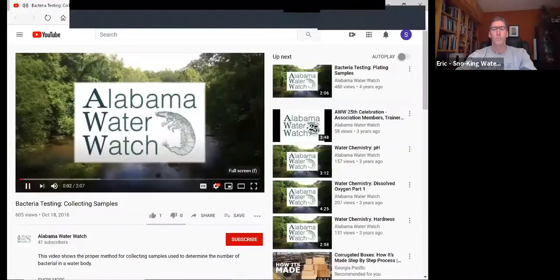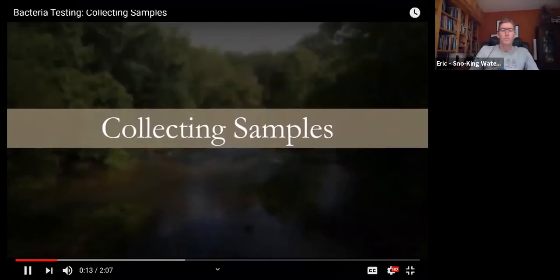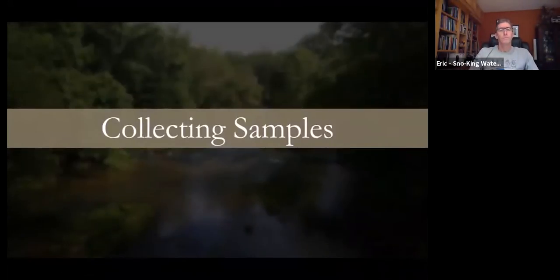Welcome to the Alabama Water Watch instructional video series. This video will show the proper method for collecting water samples used to determine the number of bacteria in the water body. This is the first step in a three-step process. The second and third steps, plating the samples and determining results, are covered in their own separate videos.